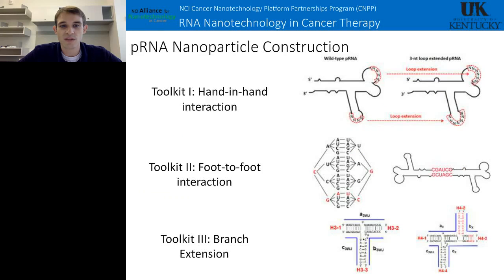But some other work in the lab uses these packaging RNA, which is pRNA molecules, to construct these different nanoparticles. One of our postdocs in the lab put in a lot of work to develop these 3 toolkits to construct these pRNA nanoparticles. Toolkit 1 is what she calls hand-in-hand interaction.